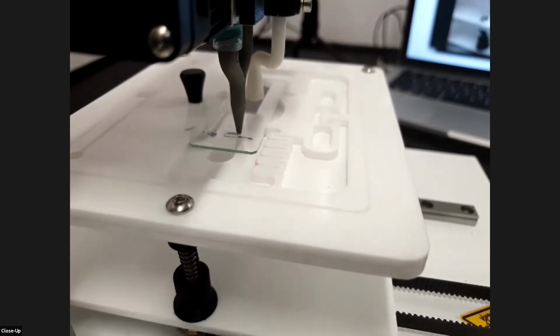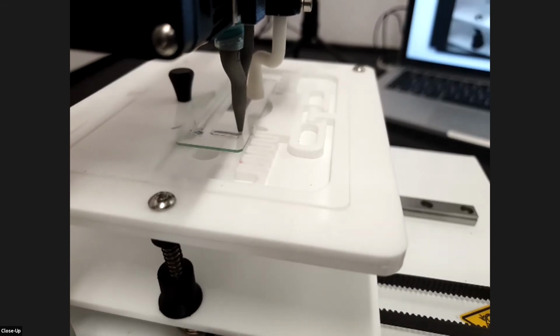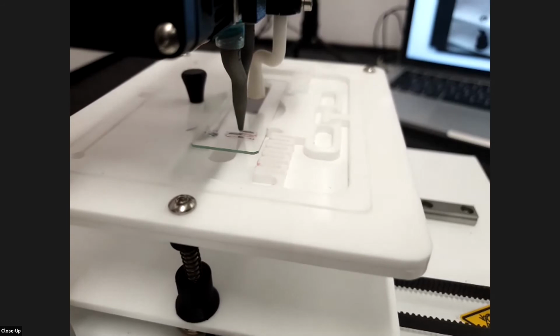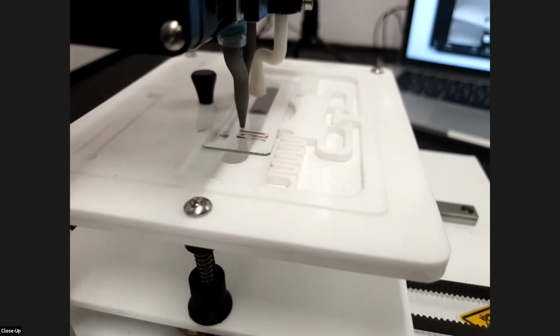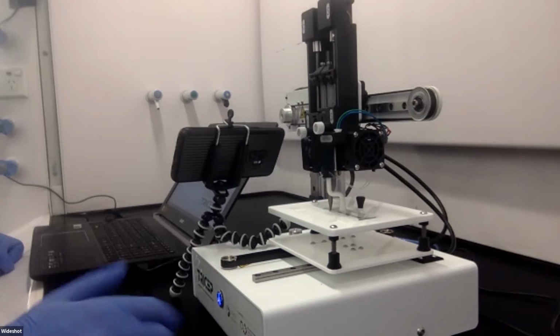You'll notice that at the beginning of this scaffold, it can jump straight into the fiber that it is extruding. This comes from a level of tuning for the materials for the print process, with appropriate extrude and retract to prevent oozing.